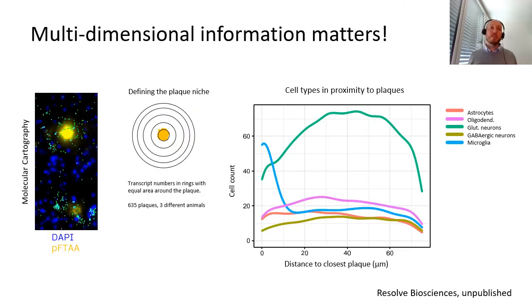The next challenge for spatial transcriptomics that I want to highlight is the dimensionality. One of the major problems we are currently facing in the field is the fact that most of the technologies we have introduced are working on sections. And these sections, due to their nature, have a very limited depth, which, as you will see in a second, might become a problem.